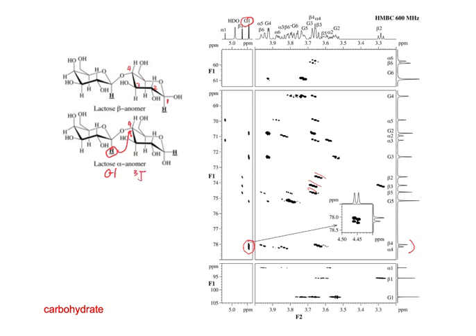And in the HMBC, this is what's good. The other systems are all, we have these 2 spin systems, but connecting the 2 sugars, we don't have a proton spin system that bridges that. So the HMBC is the good place to go to try to bridge over a heteroatom like this. Okay, so this shows that the G1 is connected to this C4, and it shows it in both, right? I guess this bridges both of these 2. All right, so that's probably the most important one here.